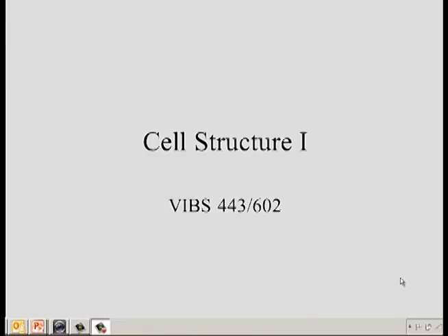Today we're going to talk about cell structure 1. We'll do basically three things. We'll look at the different types of microscopy, three different ways of looking at cells. We use the Toluidine blue. We will also look at H&E preparation, as well as PAS staining, which stains for carbohydrate-rich structures. In addition to that, we'll look for ultrastructural changes that we see at the electron microscopic level.